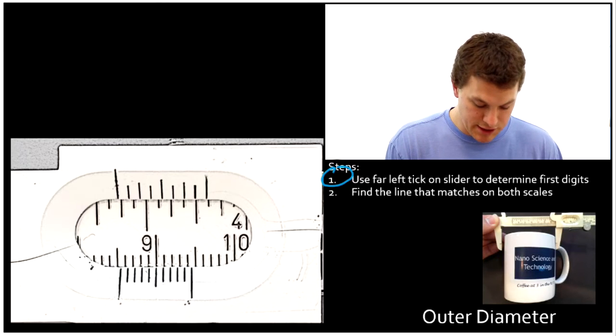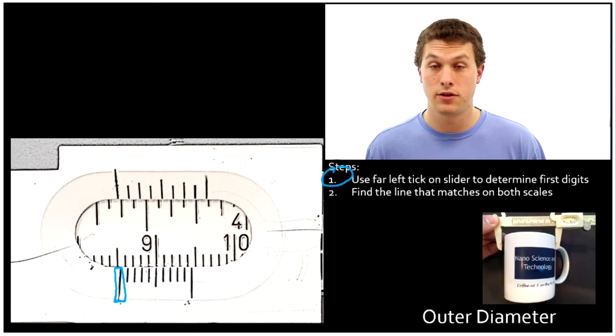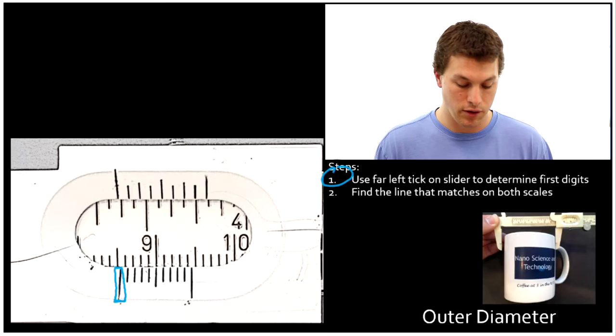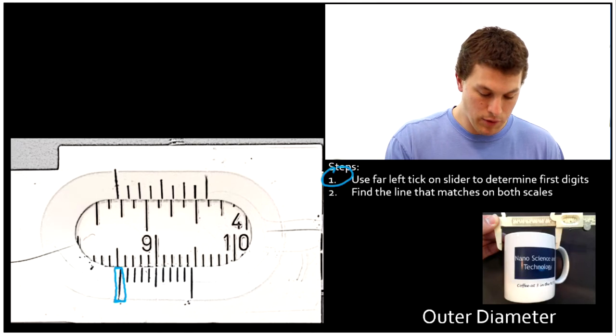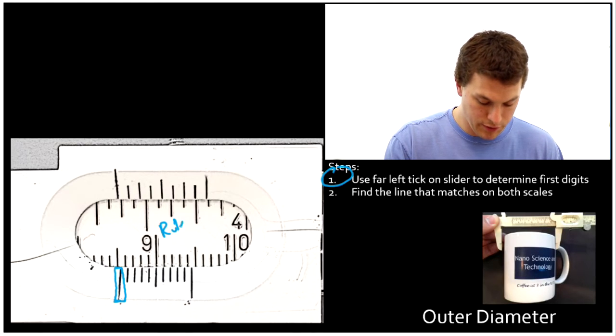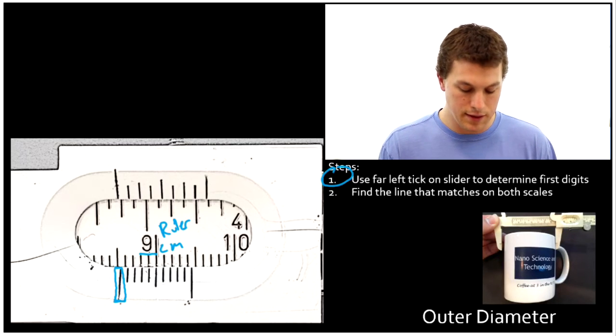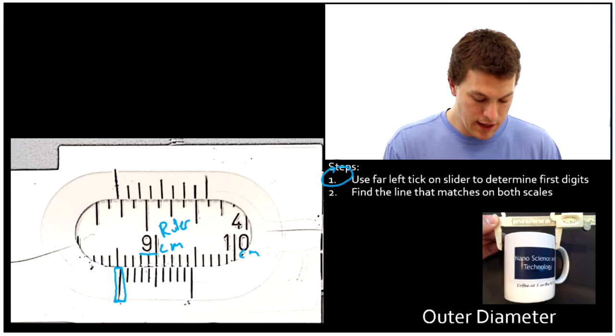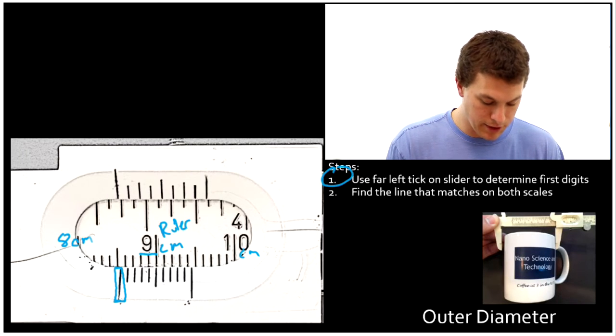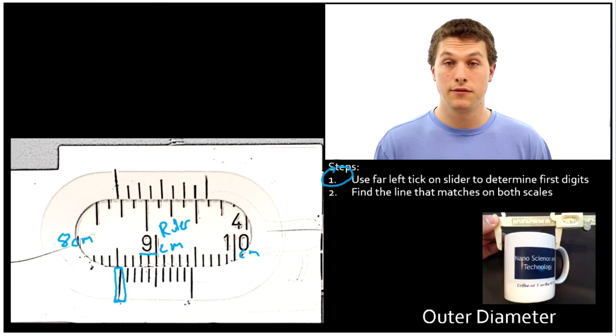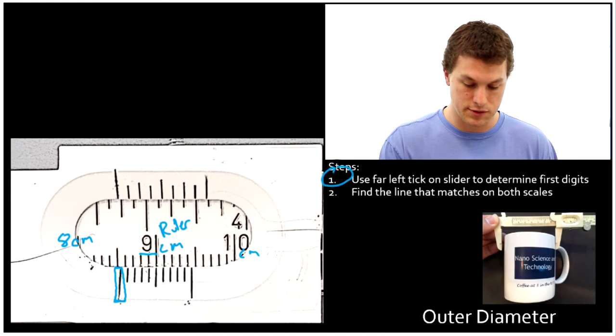For step one, we're going to look just at this leftmost tick here. The other ticks don't matter on the vernier scale, and we're going to see where it lines up on our ruler. Notice that this guy is nine here, and that's actually nine centimeters, and then we have ten centimeters over here. That means right here, even though we can't see it, we have eight centimeters, and that's important to see if you want to make the reading of your first few digits correctly.